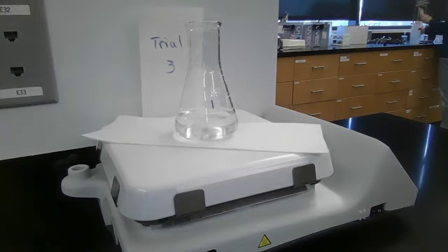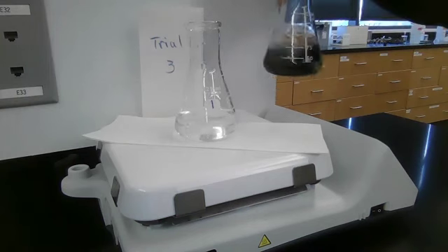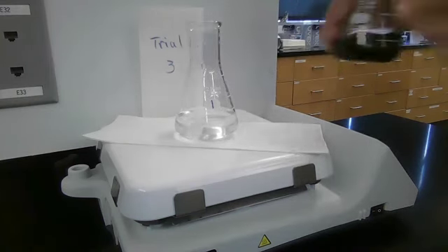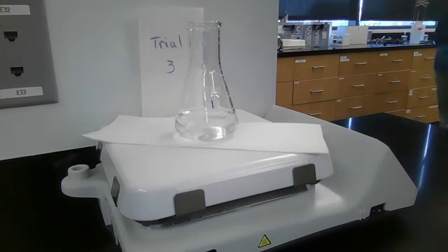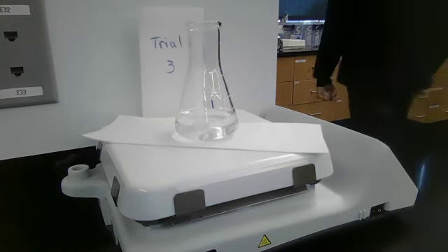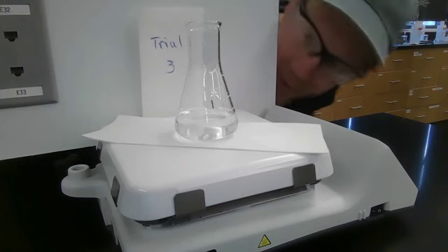Now it's looking... This was trial 2 from before. It's getting even darker because we keep producing iodine. It keeps reacting with the starch. But we only care about that initial part. That's called the method of initial rates. Bada bing. That looks nice. Here we are, sneaking in, taking a look.